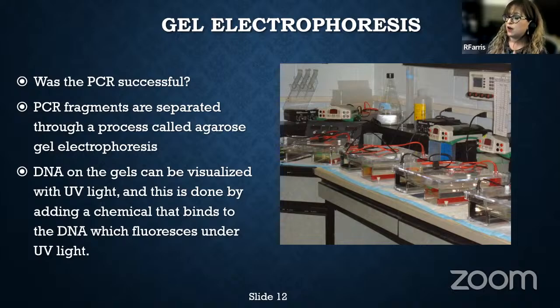So we place all of these solutions together with our PCR product, we load it on the gel, we run the gel, so we allow separation of the PCR products because sometimes different PCR products are different sizes. And then we place it under UV light when the run is complete, and that will indicate whether or not we have successfully performed a PCR. If you see something fluorescing, you will have what's called a DNA band on the gel. And I'm going to go on to the next image so you can see what I'm talking about.